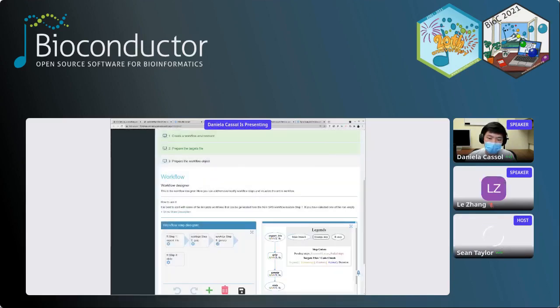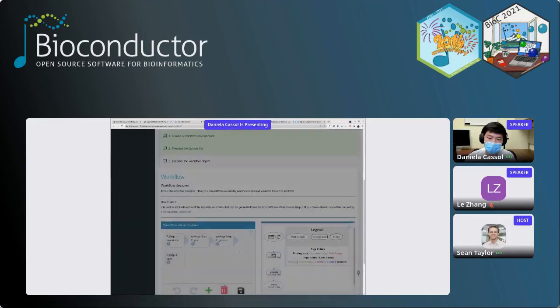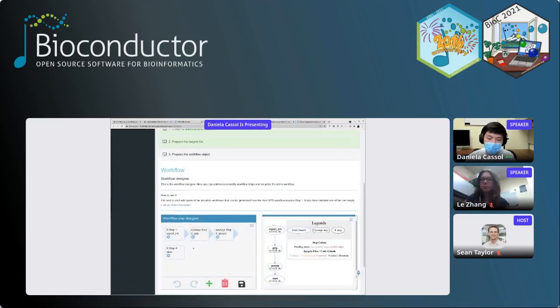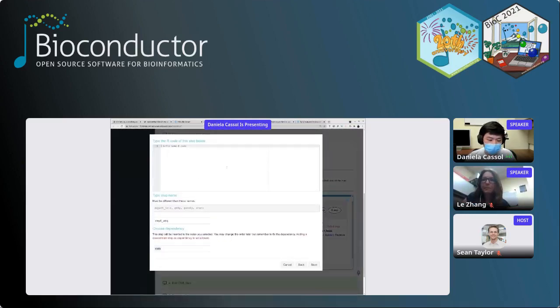Then we just unzip those files again. And in the last step, we import those files back to R and do some statistics, like binding the data frame and doing standard deviation and mean. Then finally, we'll make a ggplot. Then I can show you how easy it is if you just run your custom steps.